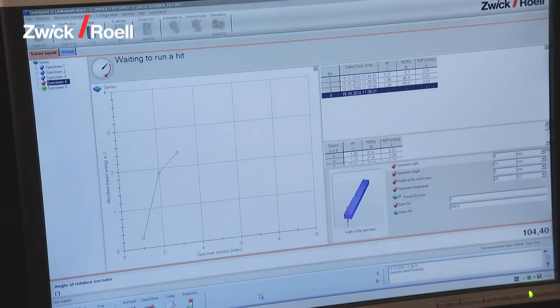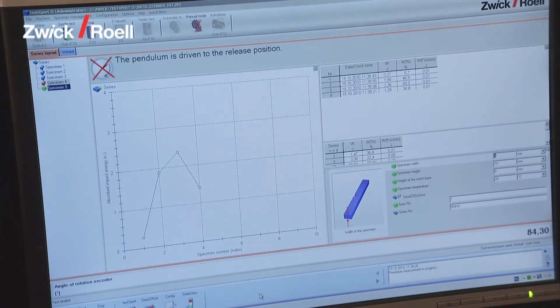The test results can now be read off directly from the screen in the TestExpert testing software.